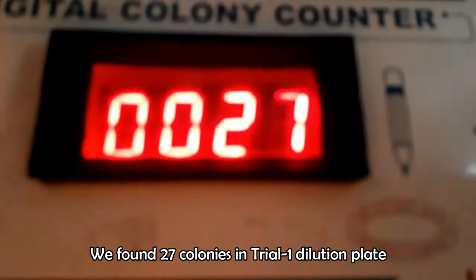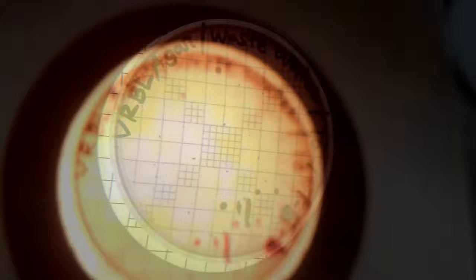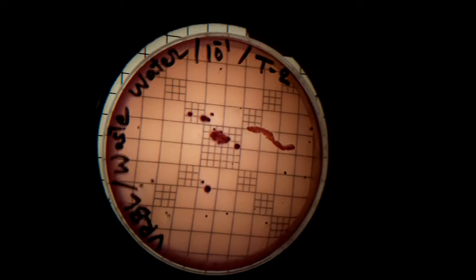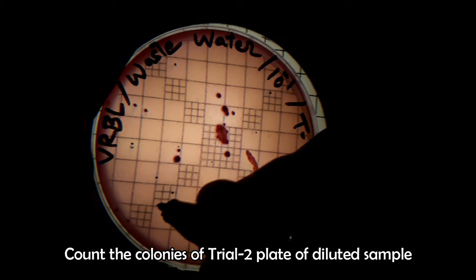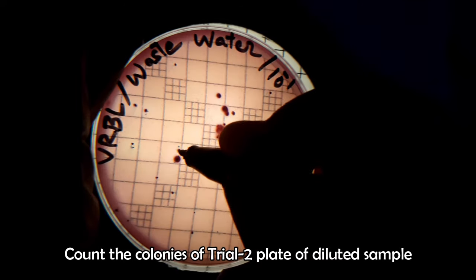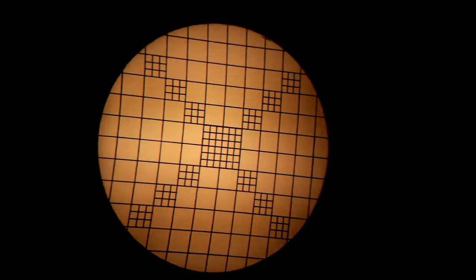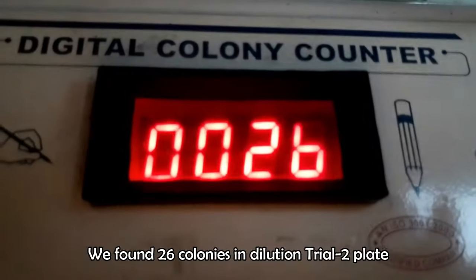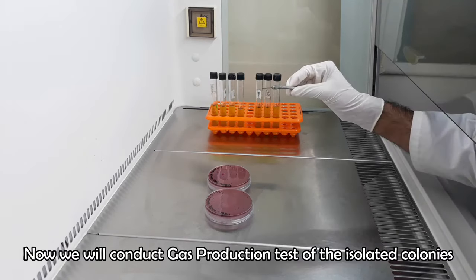We found 27 colonies in the trial 1 dilution plate. We also found 26 colonies in the trial 2 dilution plate. Now, it's time to confirm these colonies as coliform bacteria. We will conduct the gas production test for a few colonies chosen randomly from the plates.